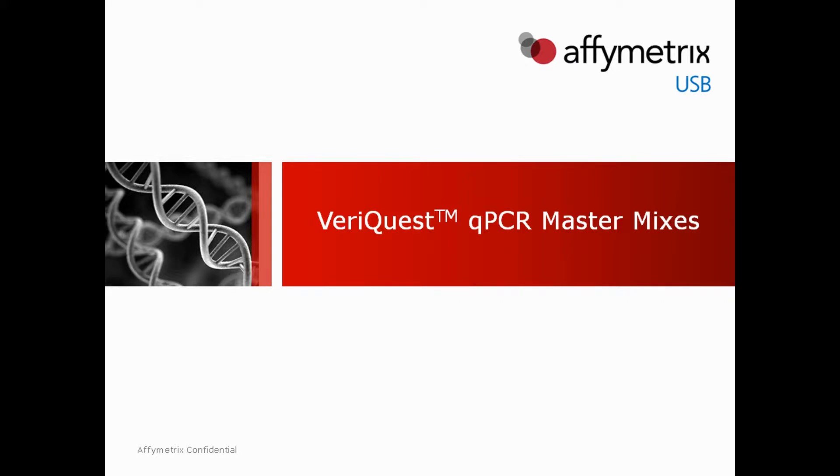The following video tutorial describes how to select the appropriate USB VeriQuest qPCR master mix and demonstrates a simple evaluation assay to assess mix performance.